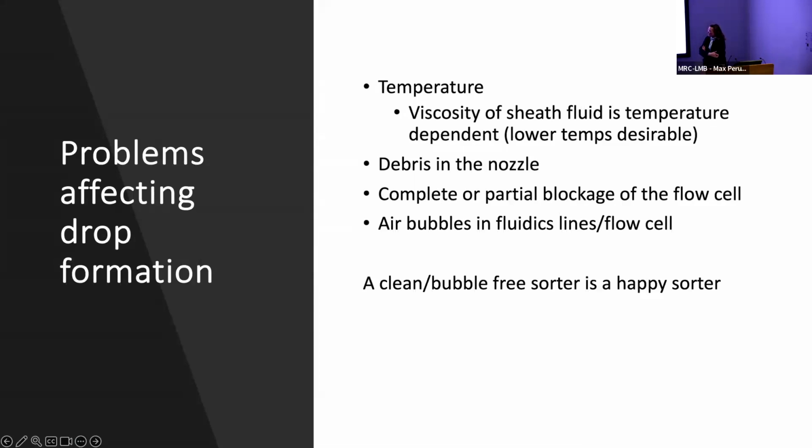Ultimately, a clean and bubble-free sorter is a happy sorter. It's quite a simple concept, even though it's quite a complicated machine. So we are constantly running our fluidics and keeping it clean and happy.